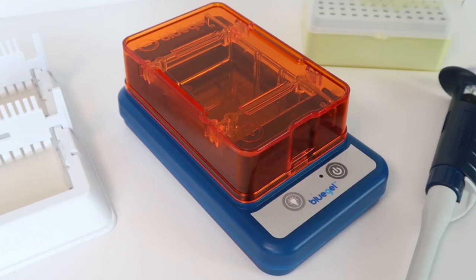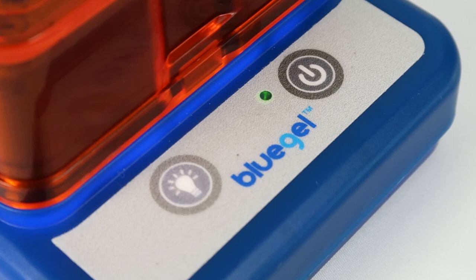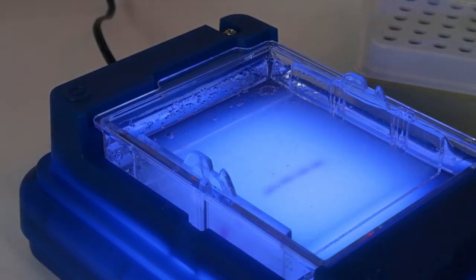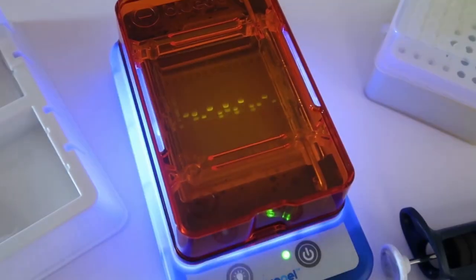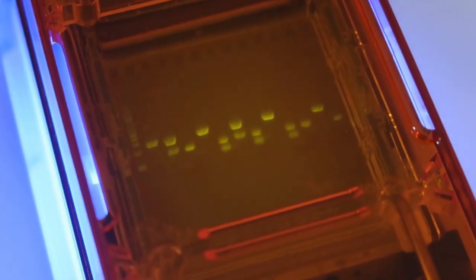BlueGel is a compact, easy-to-use electrophoresis and visualization system. By integrating gel electrophoresis and blue light transillumination into an all-in-one device, you can see results immediately with your gel still in the electrophoresis chamber, with no need for a separate imaging system or time-consuming staining and de-staining.